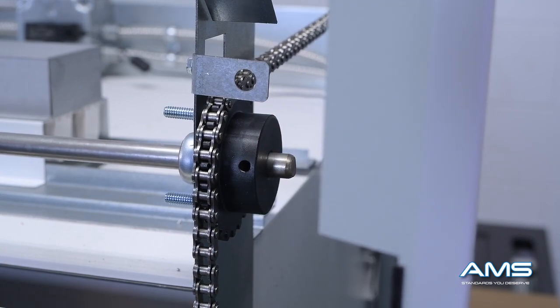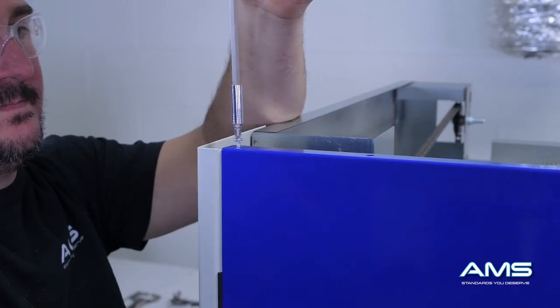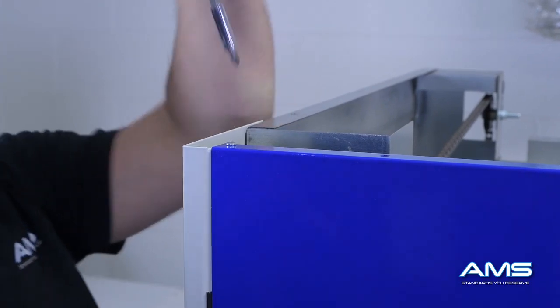This will be variable depending on the hood. Once the necessary adjustments have been completed, tighten the allen screw back in and also tighten down the screws again on the front panel of the hood.